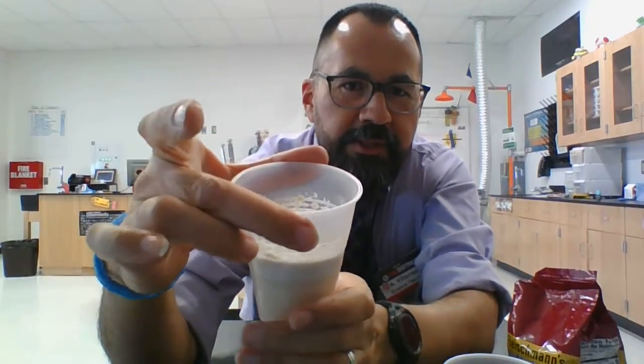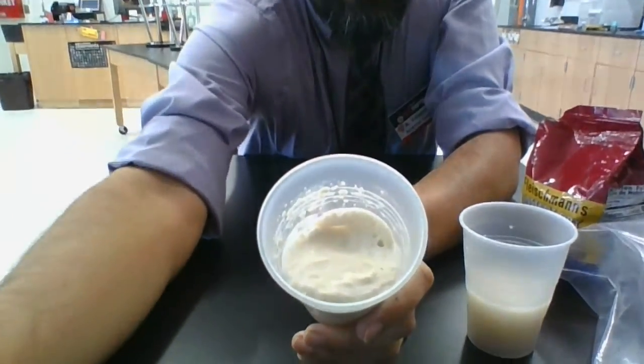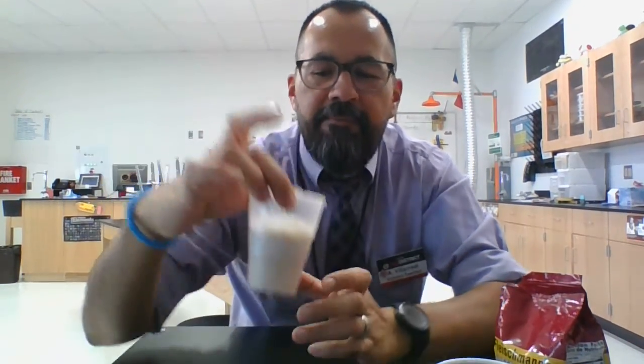So let me kind of bring this down a little bit so you can peek inside. Hopefully you can see there. We're getting a layer of foam. So that means that a chemical reaction is occurring that is producing carbon dioxide gas. And if I waft this one, ooh, there's a really strong smell. It almost smells like bread baking.